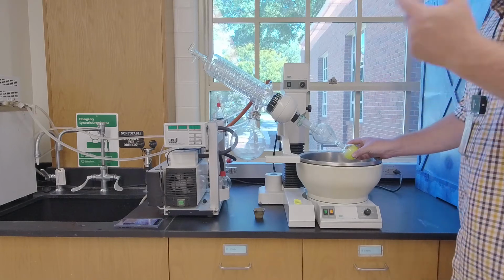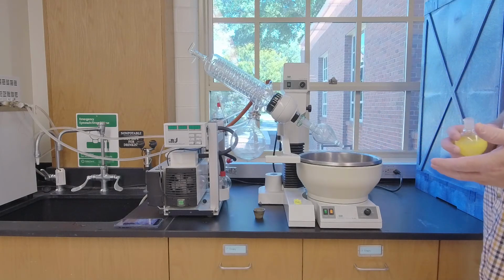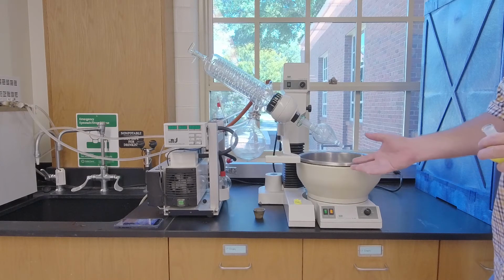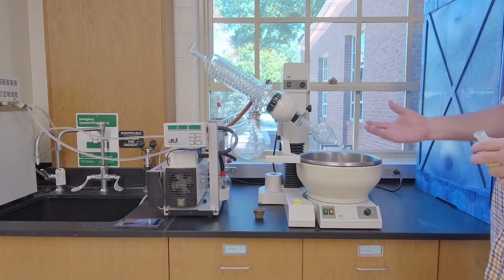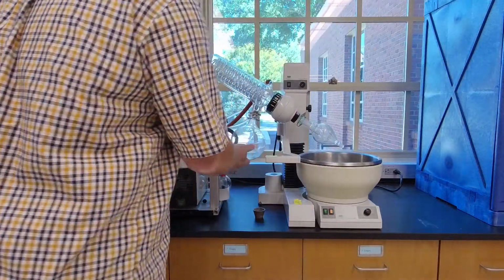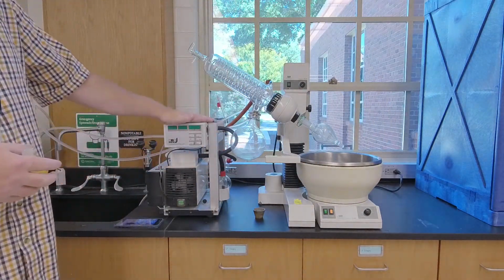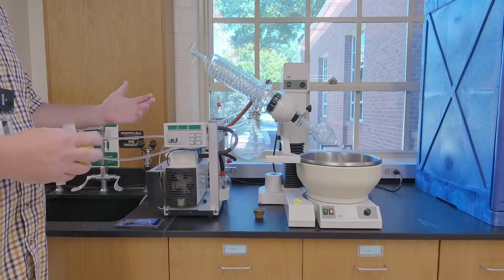We'd spin it. By spinning it, you increase the surface area of the solution and you facilitate evaporation. We have a warm bath. Again, this can supply heat to either drive evaporation or to replace the heat loss due to evaporation. We have a collection flask. The vapor that hits the condenser falls down here. And most importantly, we have this vacuum source. And again, it could be any vacuum source in reality.